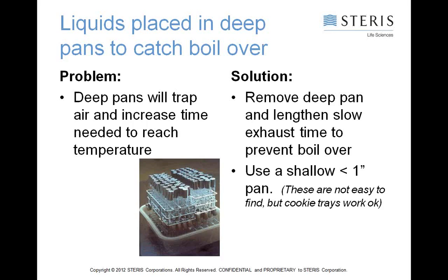You will greatly increase the length of your sterilization time, or rather the time it's going to take to bring liquid up to temperature in that case. In a case like this, with the small test tubes, it may not be so bad because you're talking about a small amount of water. But if you've got larger amounts of water, 500 milliliters or 1,000 milliliters, a liter, it can take a significant amount of time to bring those up to temperature.